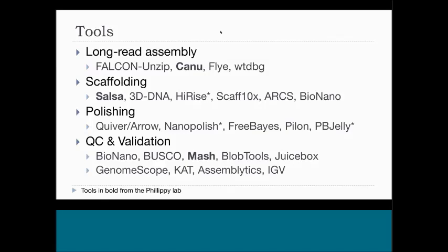As far as combining Nanopore data, I know for a fact that you can do this with Canu, and it generally improves the continuity of the assembly. And I would think that Flye and WTDBG could also combine those, but I haven't tested that.